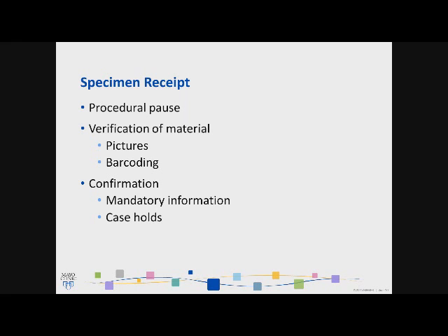Another possible reason for a mis-ID is not holding a case when you do not have this mandatory information. We all know that sometimes consultants or pathologists rush cases through because they feel like they need to get the cases. Either they need to go and have something done, they need to get out early that day, or something else like that. Sometimes it's worth slowing down and keeping a case until all necessary information is obtained.